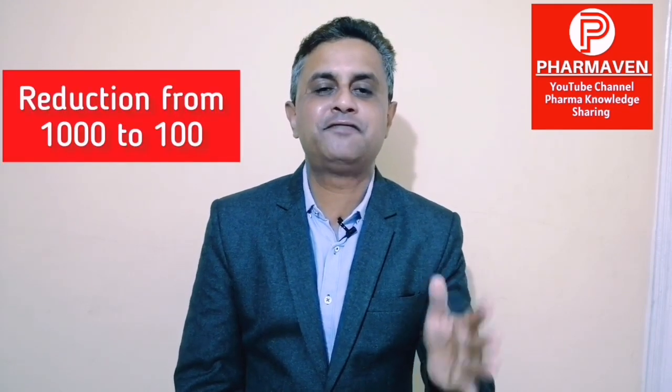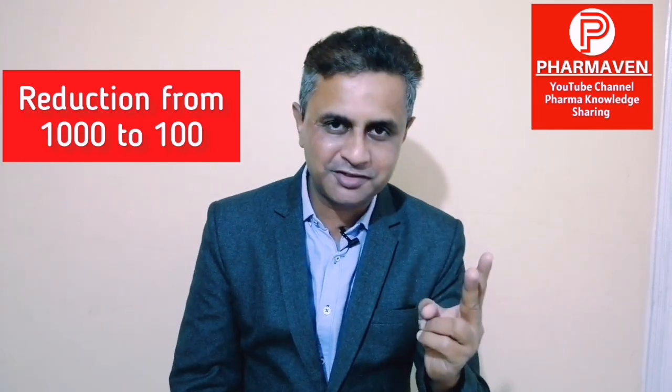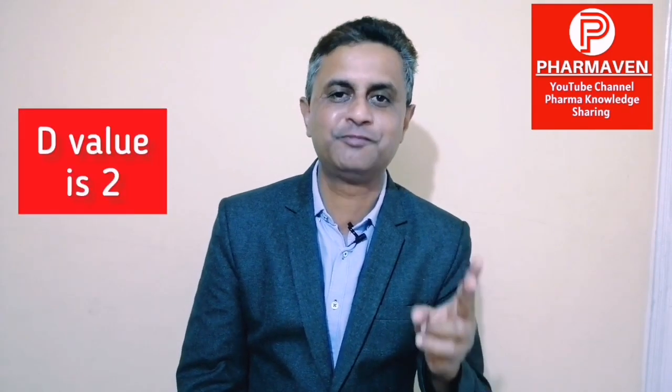So at 121 degrees, to reduce this 1000 to 100, that is a reduction of microorganisms by a factor of 10, if it takes 2 minutes, then we can say D value of that microorganism is 2 minutes. I'll explain again. When I say D value is 2, then at the specified temperature of 121 degrees, it takes 2 minutes to reduce 1000 microorganisms to 100. That is a reduction by a factor of 10, which we can call 1 log reduction. Then we say that D value of that microorganism is 2.